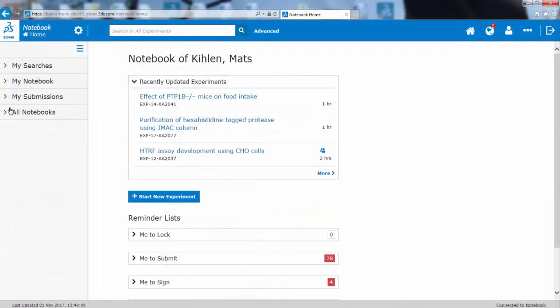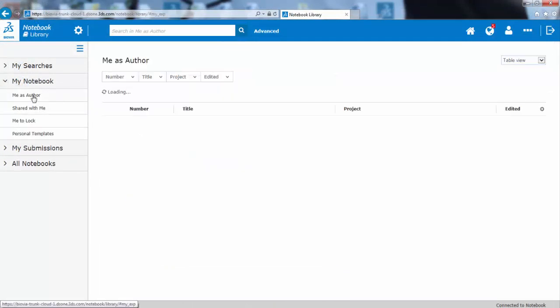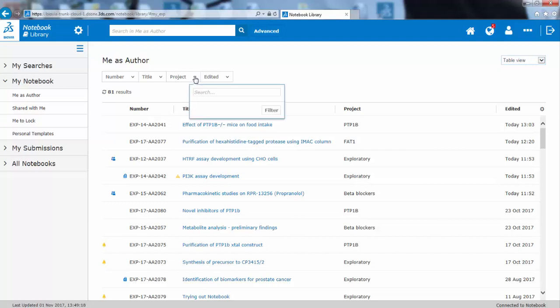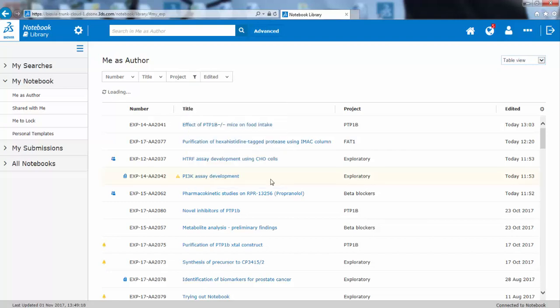In the web client, the left-hand side panel contains search filters and your own Notebook, where you can see experiments where you're the author. In this view, you can filter and sort, so you can extract the experiments. For example, you have a PTP1B project.